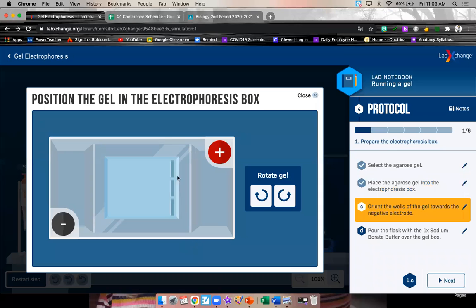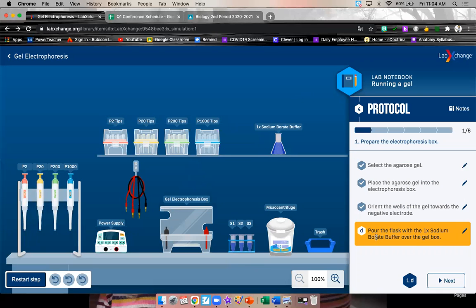Click on the box. And here are the wells. We want them on the negative side. Then pour the flask of the buffer over the gel box. So here's your buffer. And pour it over the gel. We get rid of our empty glass.